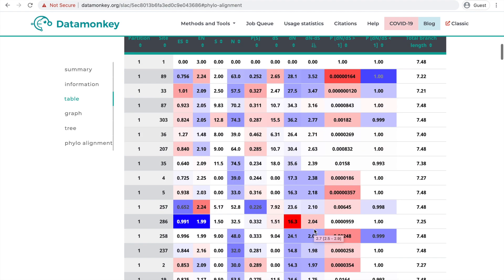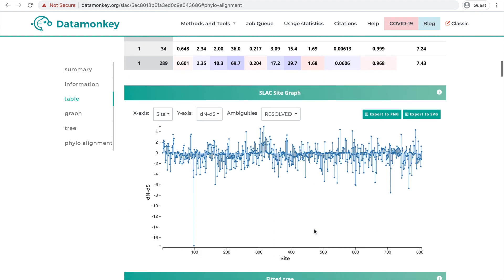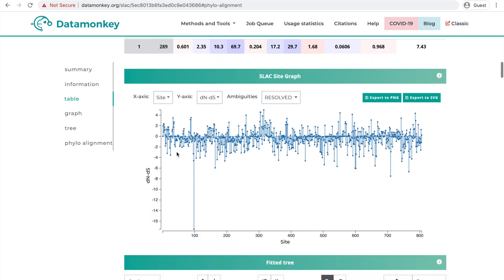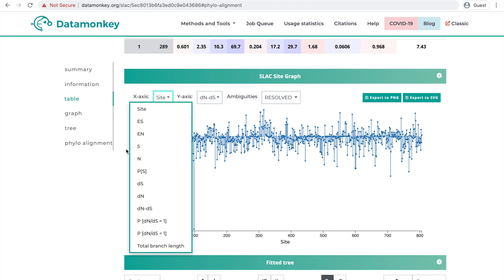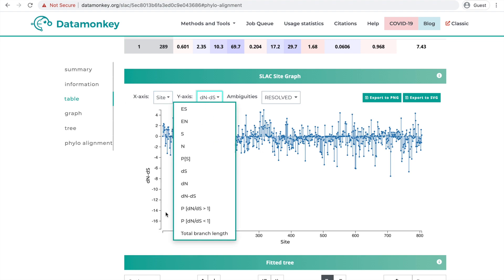Scrolling down, you can see this displayed graphically as we have the dn minus ds plotted against the sites. With this graph, you can change the x-axis or the y-axis to suit your needs as well.